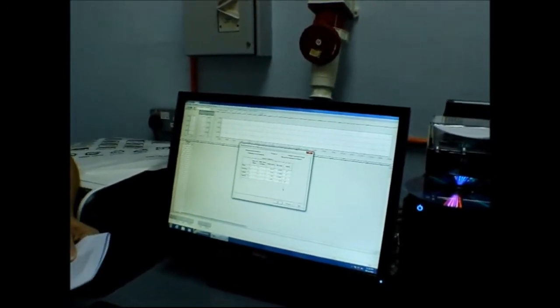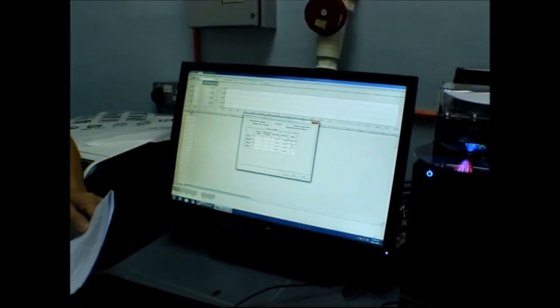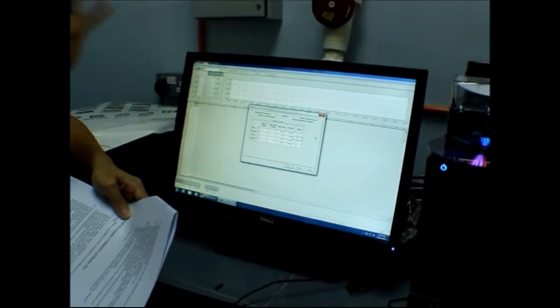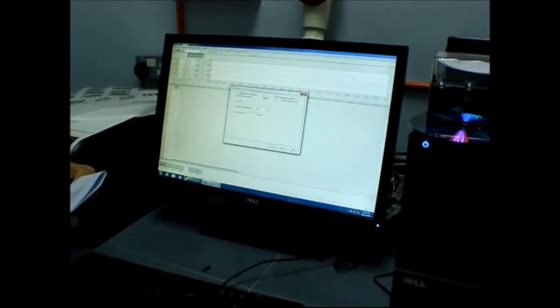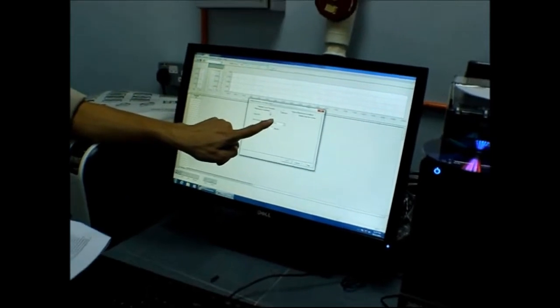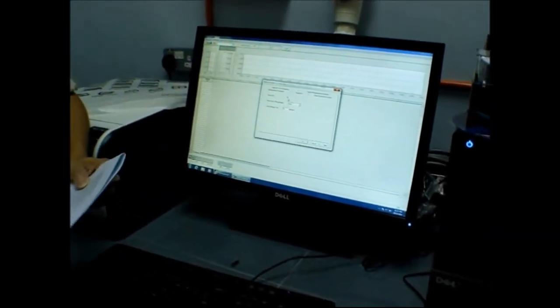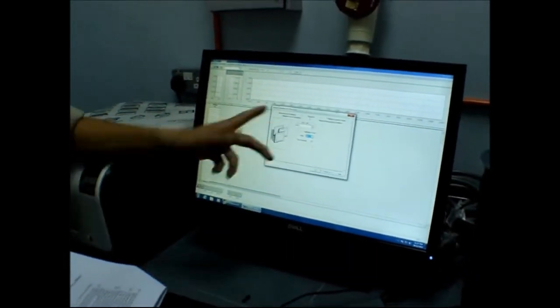Okay. Finish. Then you click the sequence. Do we need to change every time we use? No need. This one's first time only. After that, they will save this setting. Okay, go to sequence. We use ASC, auto sampler. We have used this one, so check this one. After end the measurement, stop. Okay, no need to change. Then click the calibration curve parameter. Okay, no need.